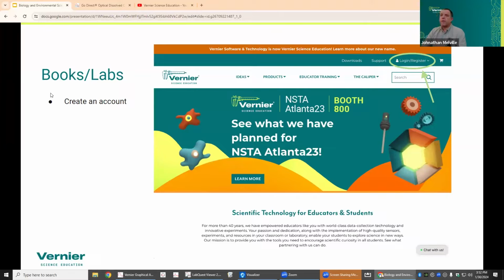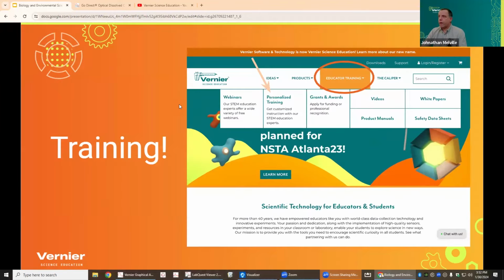So the big thing to do is to create an account and make sure that you use your school email address when you create that account. If you need personalized training, like I said, we'll give you personalized training. You can also tap on where it says educator training. There's personalized training that you can get for free. If it's under an hour, someone could come out to you as well. And if you want to see this webinar or look at other webinars, just tap on where it says webinars and you can take a look there.